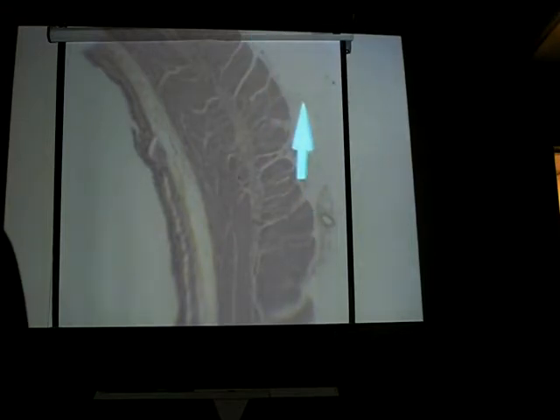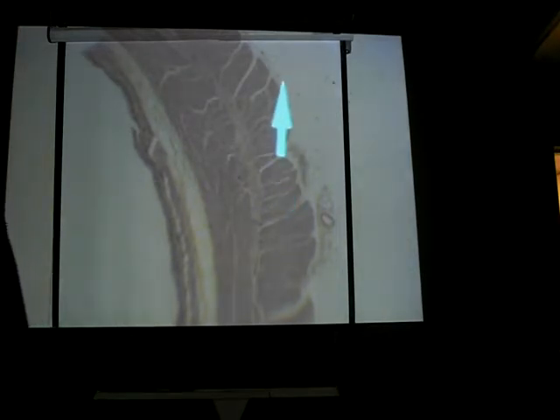Alright, so remember you have some organs whose surface is towards the peritoneal cavity, so they're going to have that simple squamous covering. If the connective tissue on the outside is continuous with the surrounding connective tissue, then when you pull the organ out, you pretty much just have that little piece of connective tissue at the end, so it's called an adventitia.